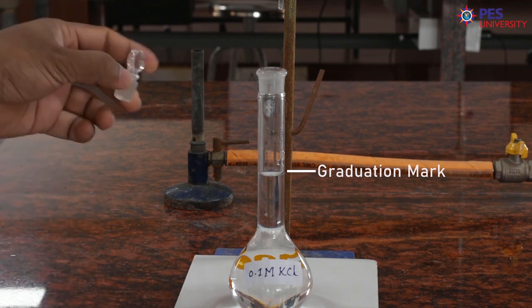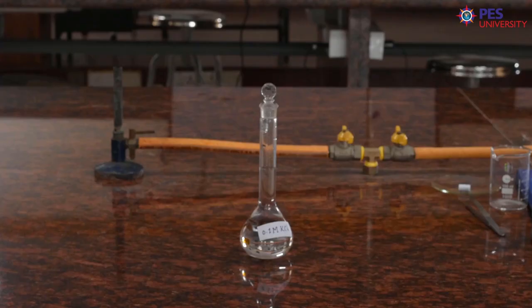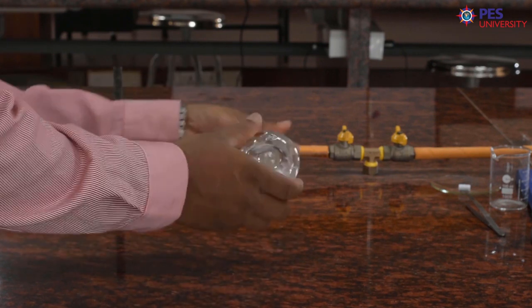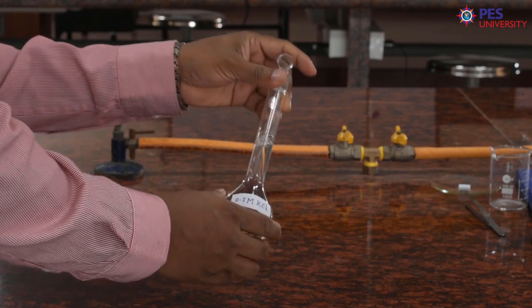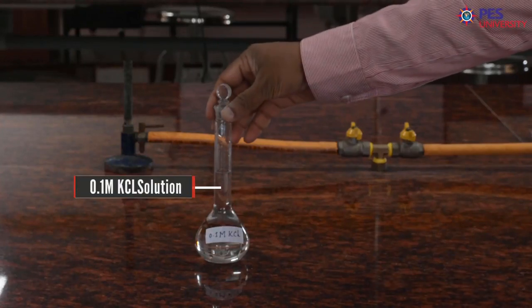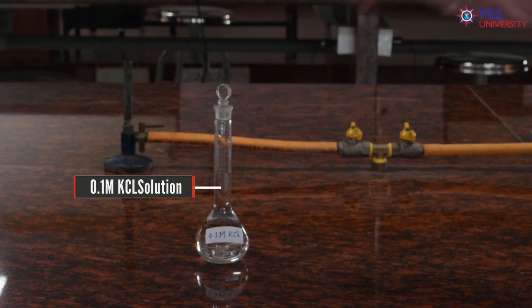After that, close with the stopper. After adding water up to the mark, tilt the flask and shake the bulb 2-3 times for uniform concentration. Now we have prepared 0.1 molar KCl solution. By using this solution, we have to prepare 0.01 molar KCl solution.